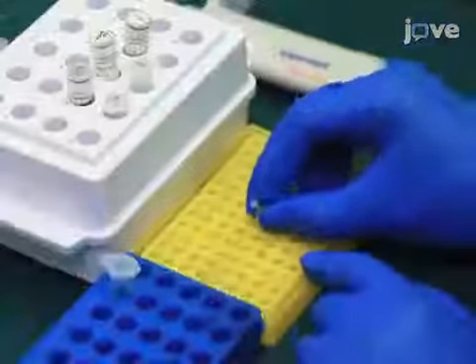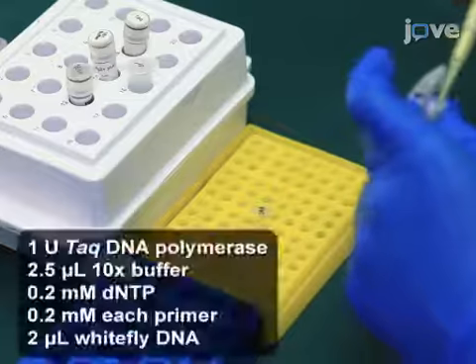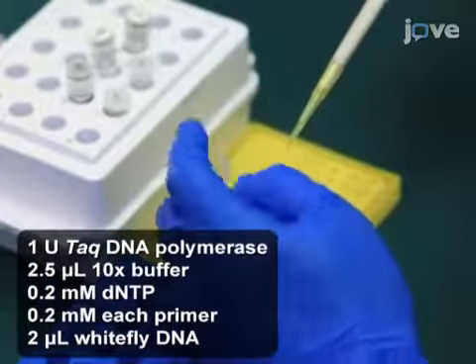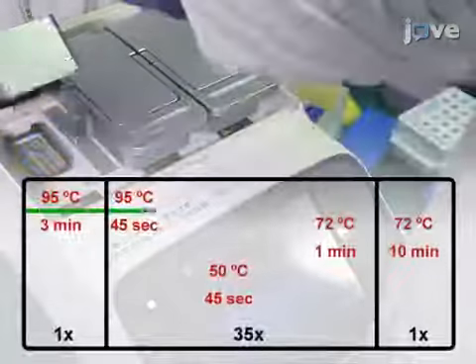Using whitefly DNA and mitochondrial cytochrome oxidase 1 primers, prepare 25 microliter PCR reactions using the following reagents. Then, run the PCR reactions using the program shown here.